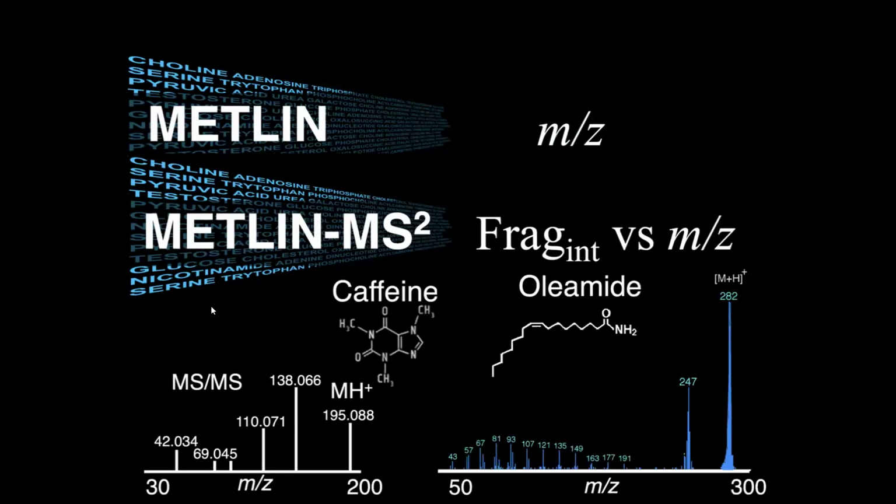And this is actually a molecule that we analyzed back in 1994. This was with Richard Lerner and Ben Cravatt. This was an oleamide, and this was in a sleep study that we were performing on cerebrospinal fluid. This is the molecule that we identified as associated with sleep deprivation. And it turned out to be a Science paper at the time.